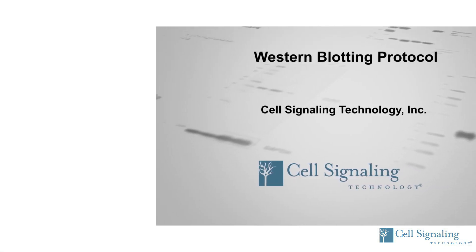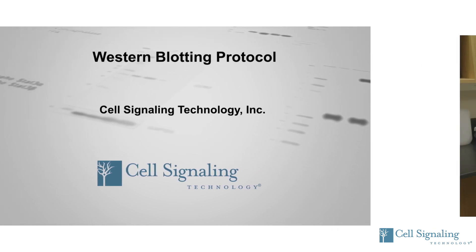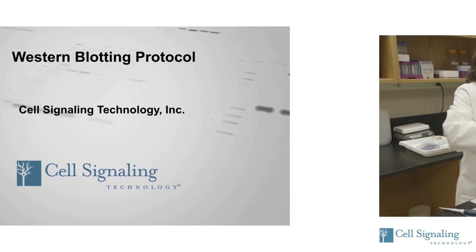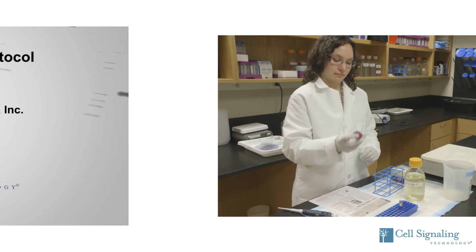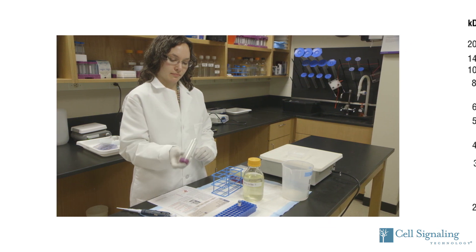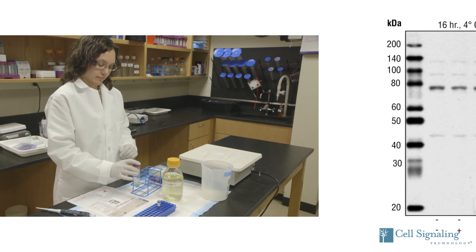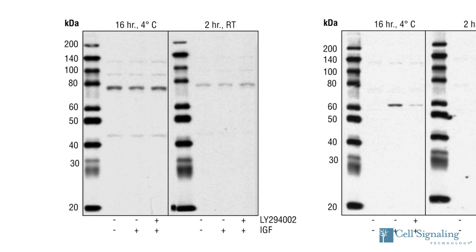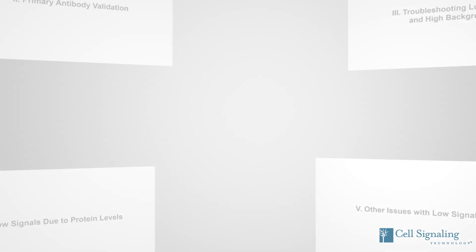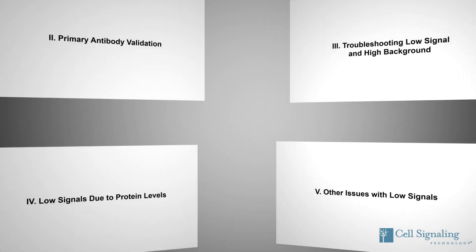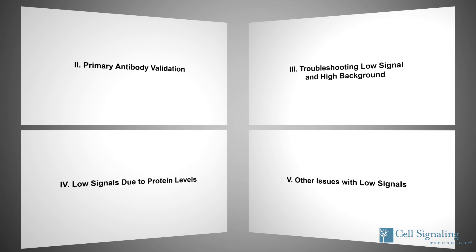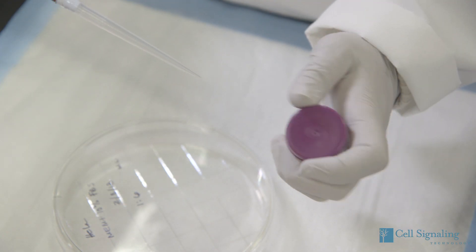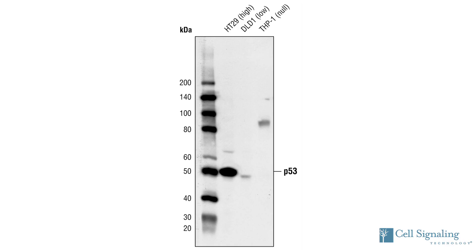This is the second video in our two-part series on Western blotting. The first video, Western Blotting Protocol, provides a comprehensive Western blot procedure used in-house by Cell Signaling Technology scientists to validate our antibodies. This second video provides a guide to help you troubleshoot, suggesting tips to help diagnose problems and providing solutions to ensure you get the expected results in the shortest amount of time.